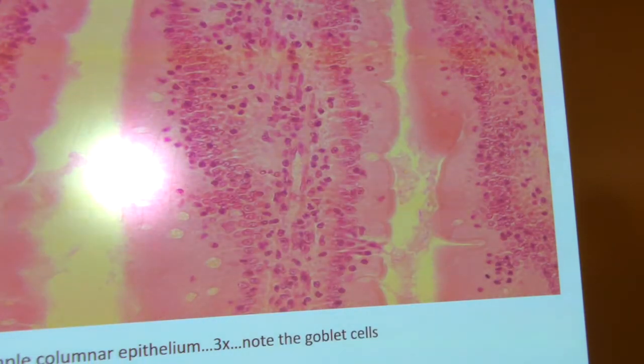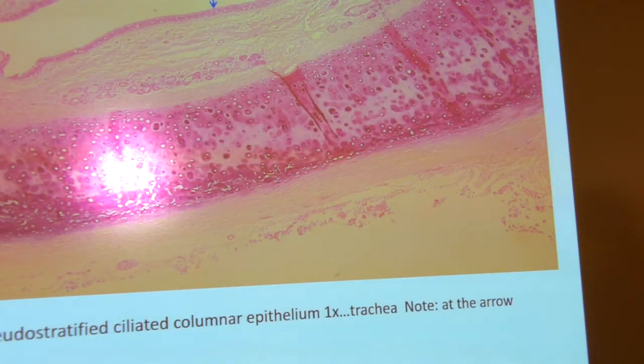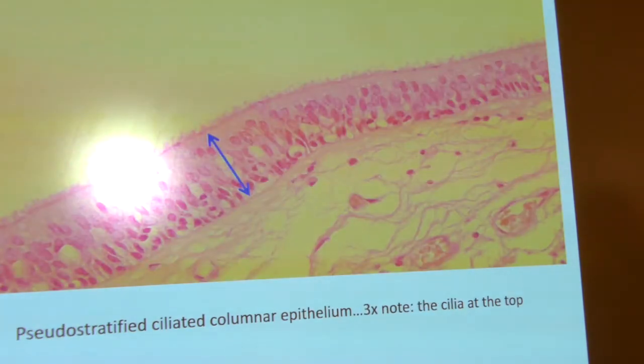Columnar epithelium, which are longitudinal, they act as the glove, and the connective tissue is the finger in the glove. And then in between the columnar epithelium, you have goblet cells. Then we go to pseudostratified ciliated columnar epithelium. What gives this tissue away is the cilia at the most apical surface of this epithelium near the lumen.